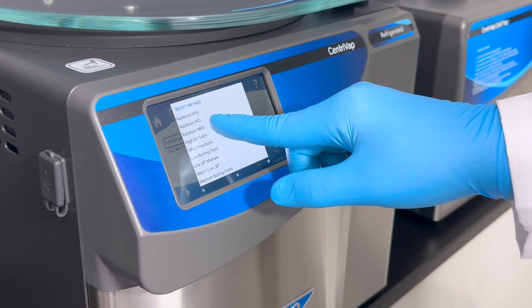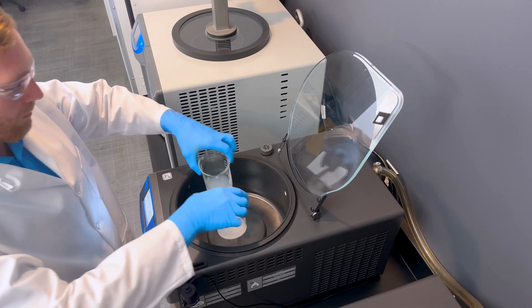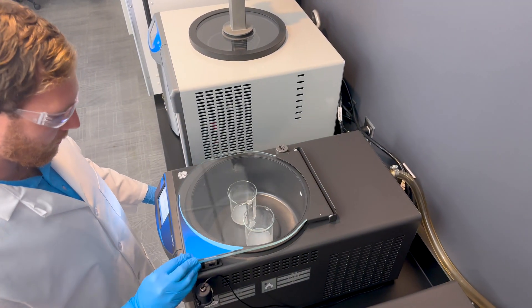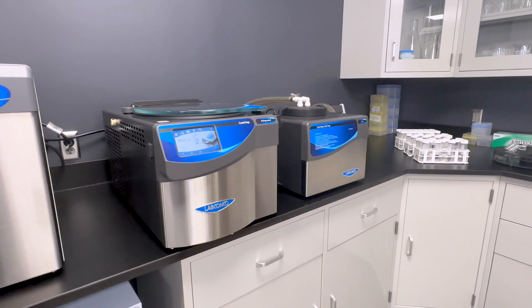A selection of pre-programmed methods provide researchers with general run parameters right out of the box. With proper system configuration, the Centrivap Pro can also double as a small-scale lyophilizer and a vacuum desiccator, providing unparalleled versatility for diverse laboratory applications.